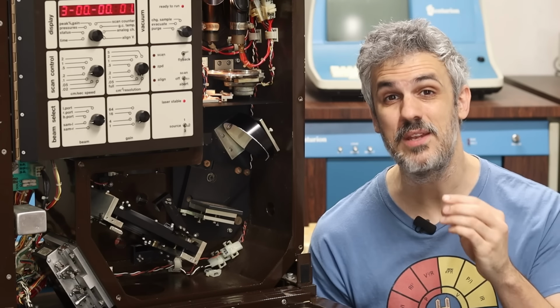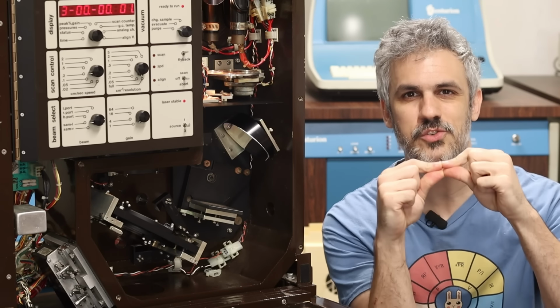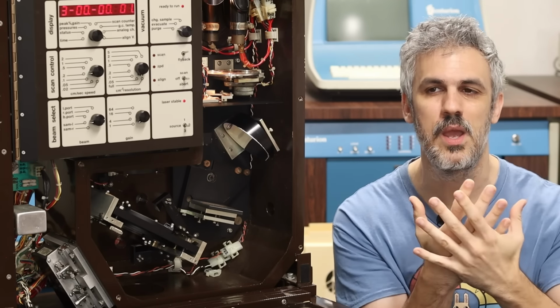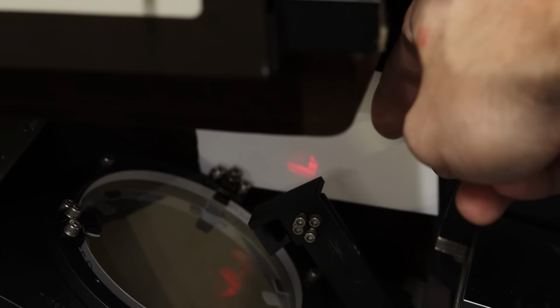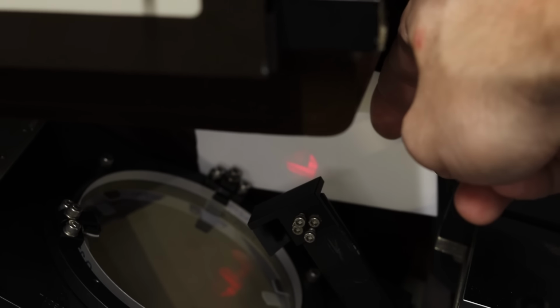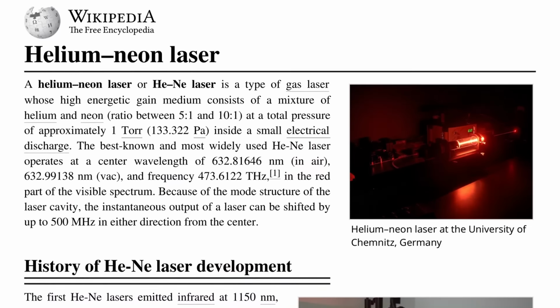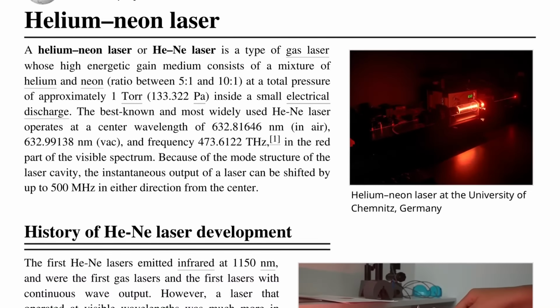Furthermore, the laser is being diffused. It's not a hyper pinpoint of concentrated light. It's spreading out into about a centimeter wide beam. Now that is still somewhat dangerous, but it's not nearly as dangerous as the pinpoint of light. But also, this is a helium neon laser, and it's only 2 milliwatts.